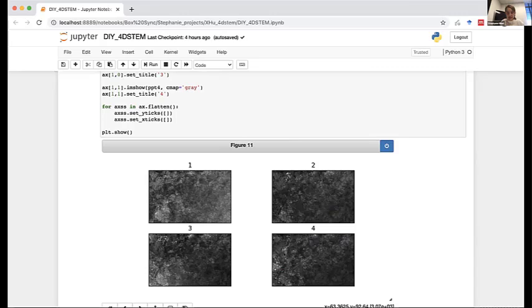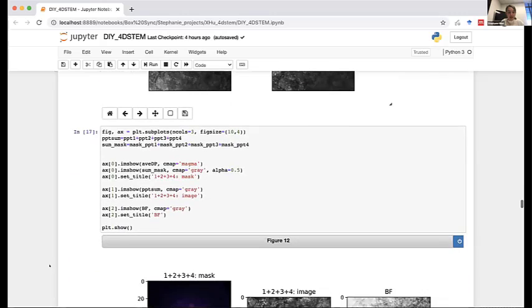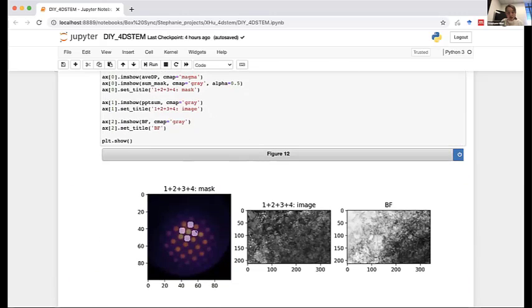But what I'm going to do for simplicity for today is just sum them. So I'm going to end up with something like this. I've now created a detector that is 4 circular disks that are not connected that go around my central disk. I sum them and I get this image to compare to my bright field with very strong contrast that shows where the second phase is. And I think this starts to show some of the value of writing your own code and doing it in Python. I've created a detector that's not physically realizable in the microscope to be able to get some really interesting, important information about my sample. And I've done it with some really basic code, creating these simple shapes and using them as a binary filtering mask to assess my sample.